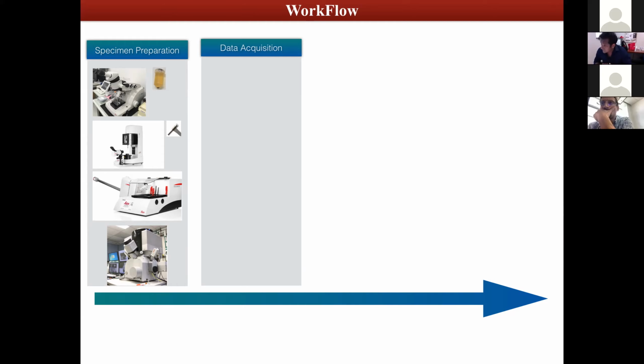You can transfer it to the system directly if that is not requiring cryo temperature, or if you need cryo temperature, you will use something like the Leica instrument that I have shown here, and then you will transfer it to the SEM. Now, the data acquisition.